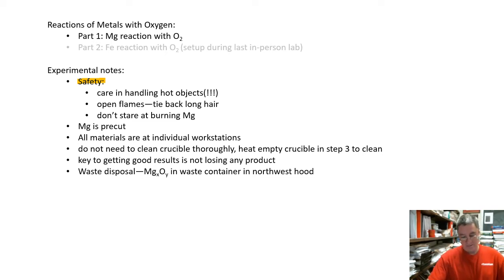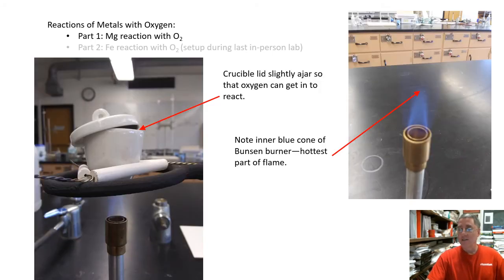Let's see where we're at here. Okay, so I took some pictures of the setup because normally we would kind of show you this, and I know the TAs will be there to assist. Hopefully you're able to light a Bunsen burner. The way you light a Bunsen burner, I'll demo this with, in fact, this is how I would normally do it in the pre-lab too. Pretend this pen is a Bunsen burner, okay?